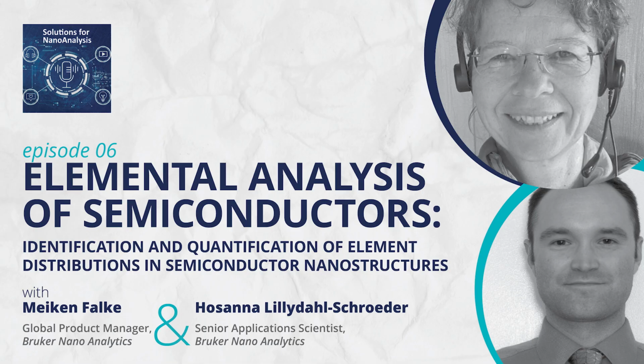So since we're talking about different length scales, basically, and further miniaturization of various chips and semiconductors, other materials in that particular industry, what type of length scales would we be seeing use for in these studies as far as application for TEM versus SEM? What would be some good or relevant examples where each technique, or type of microscope, would be appropriate?